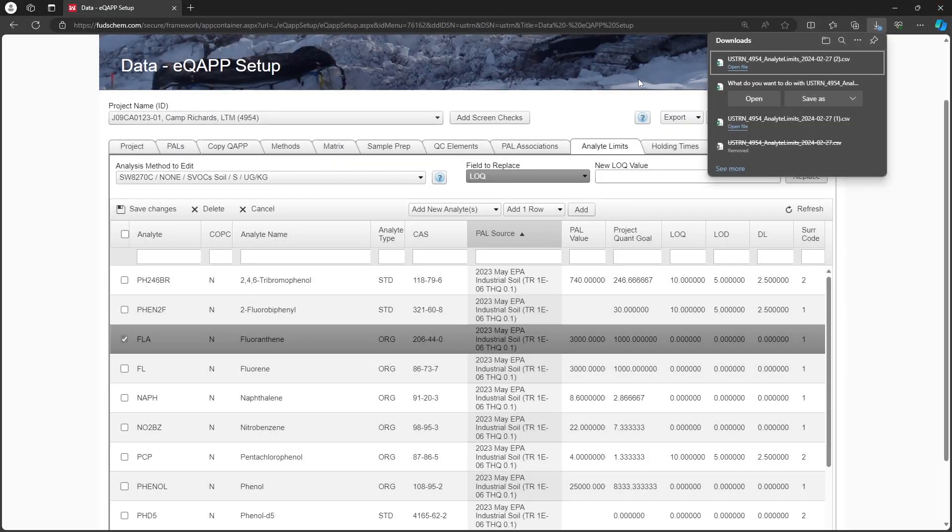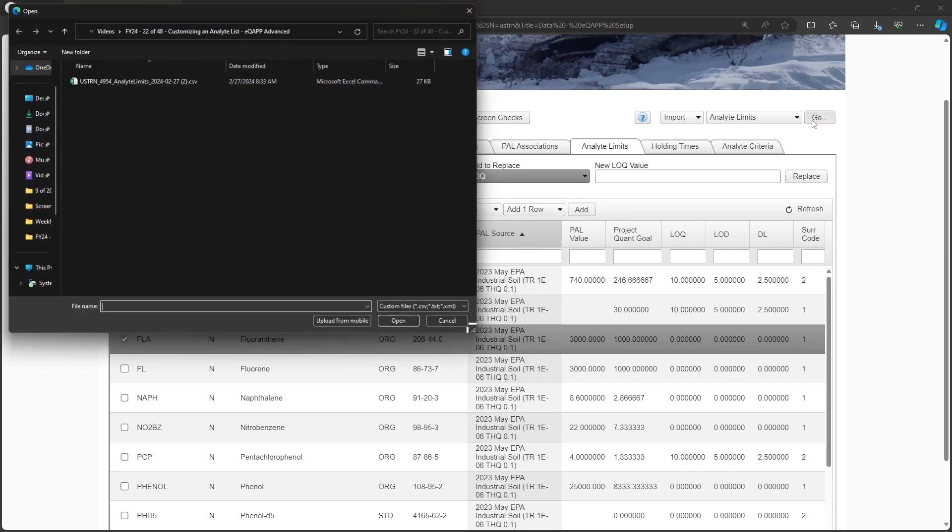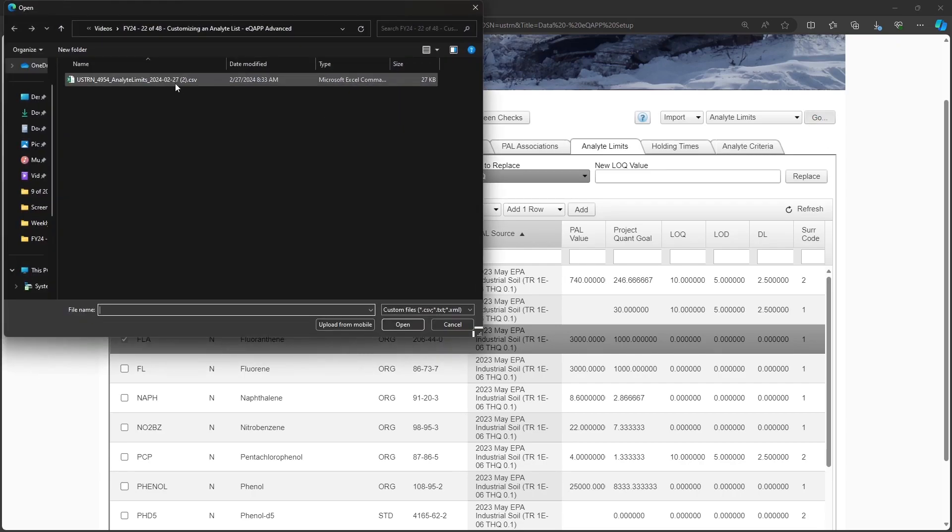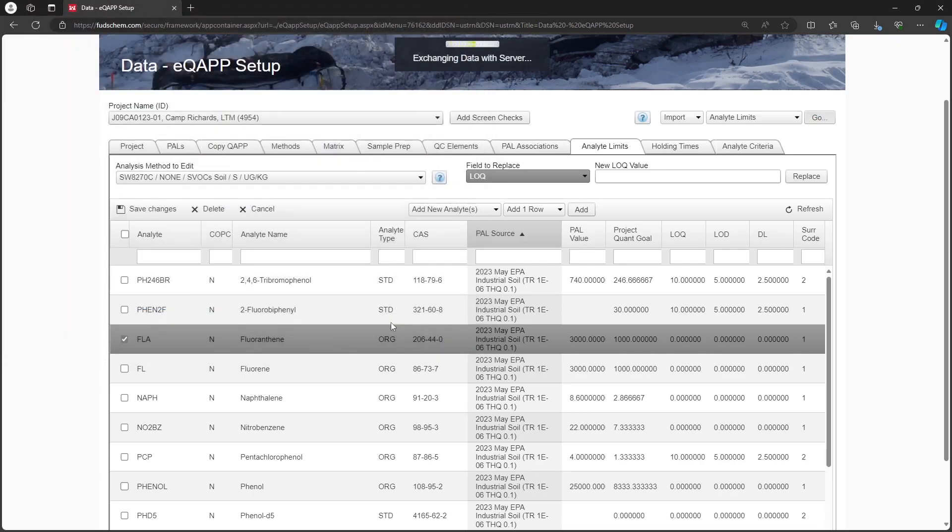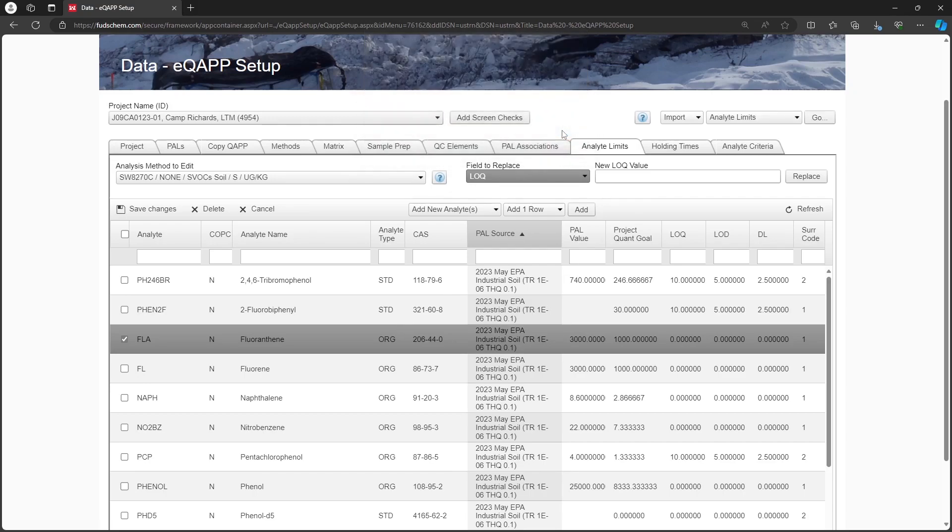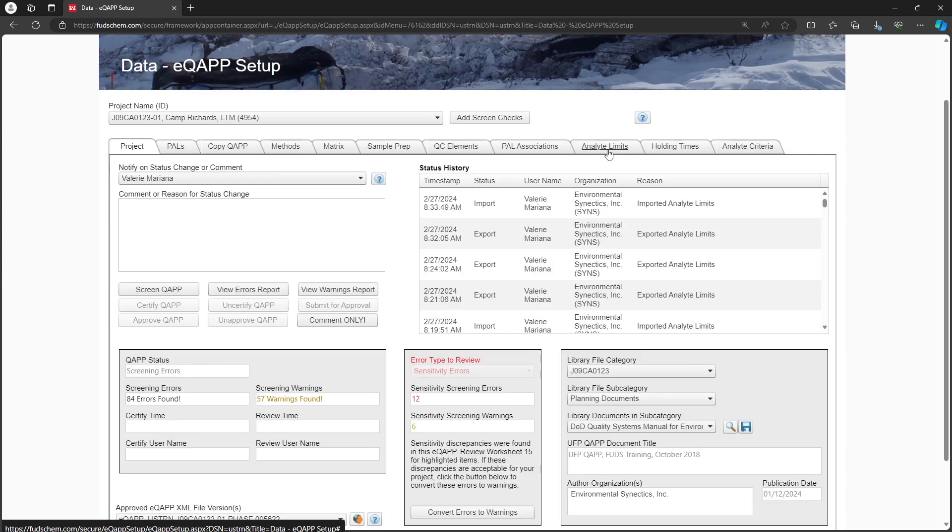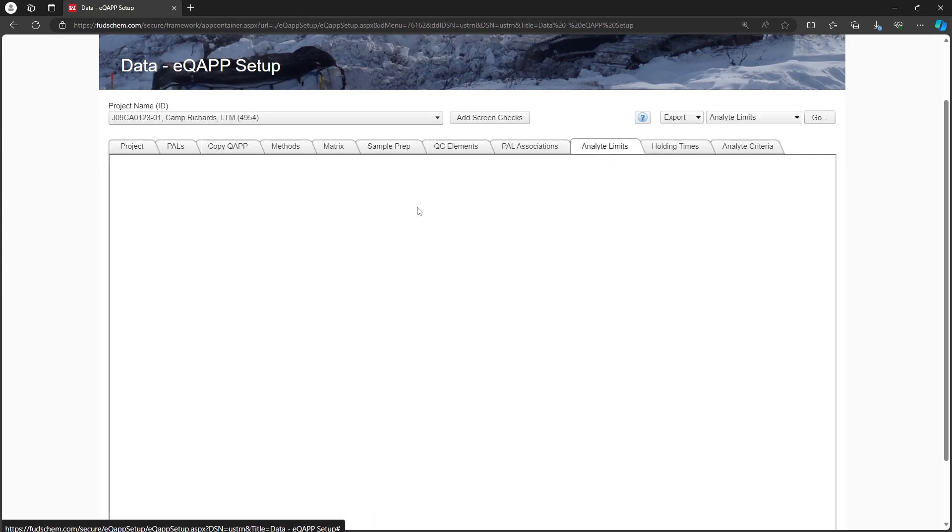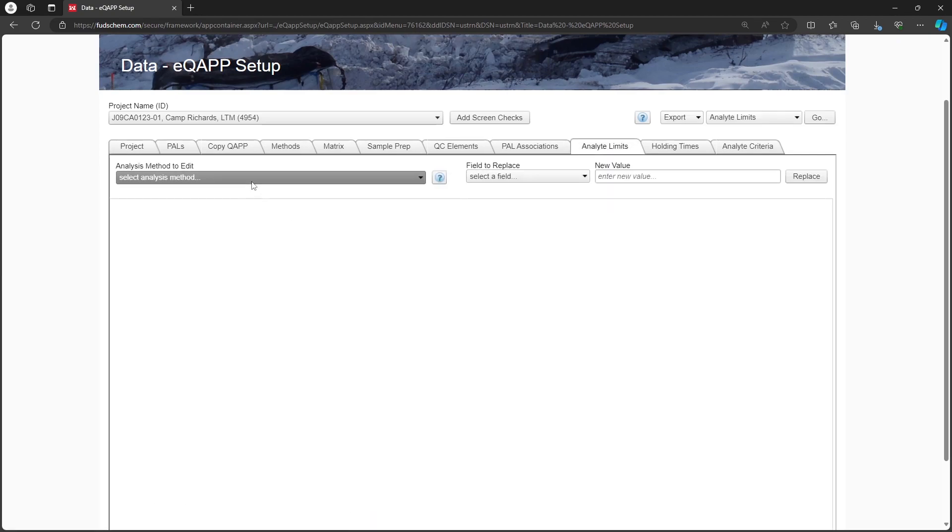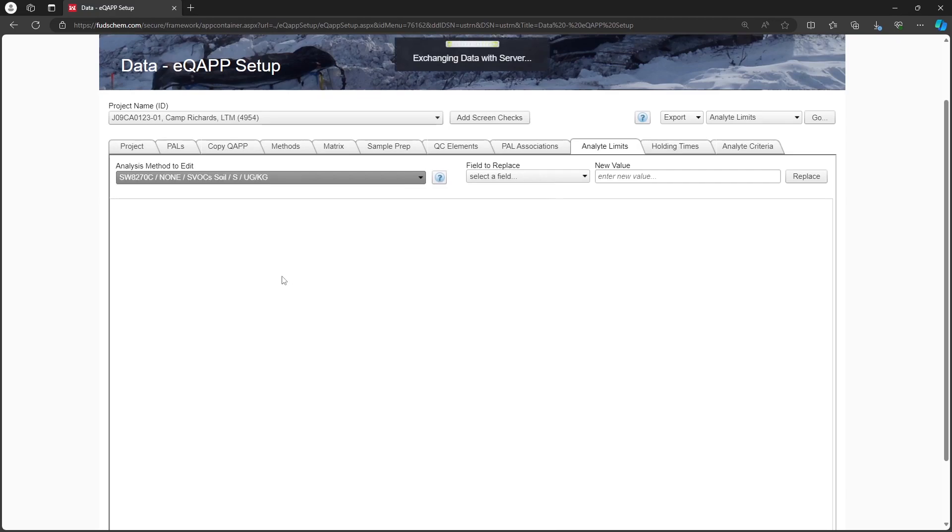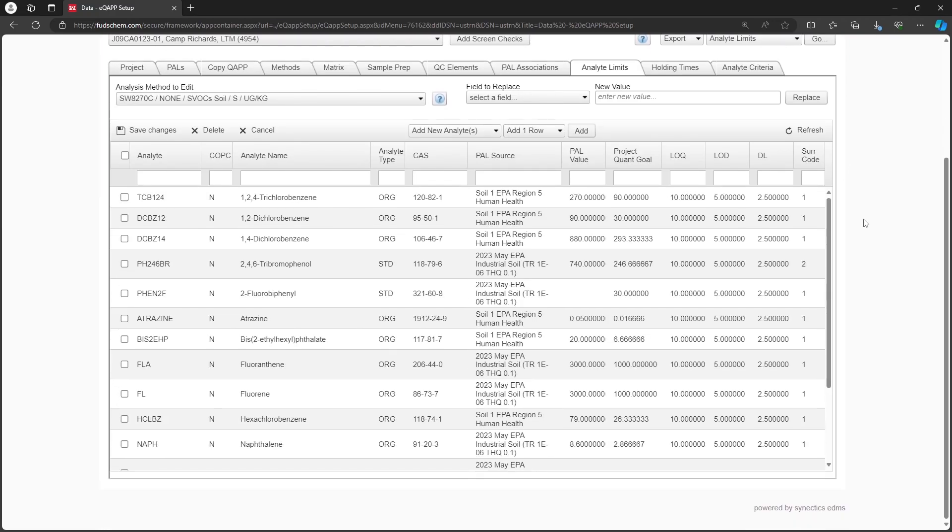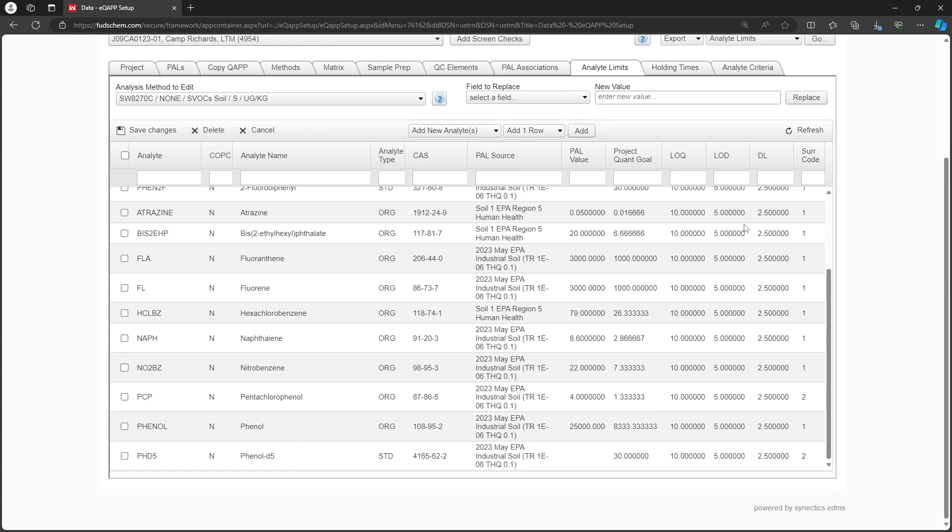Back in the EQAP, change the drop-down from Export to Import. Click Go and import the file. Once imported, select the method again on the Analyte Limits tab. We can see that the limits are populated. This tab has been completely updated.